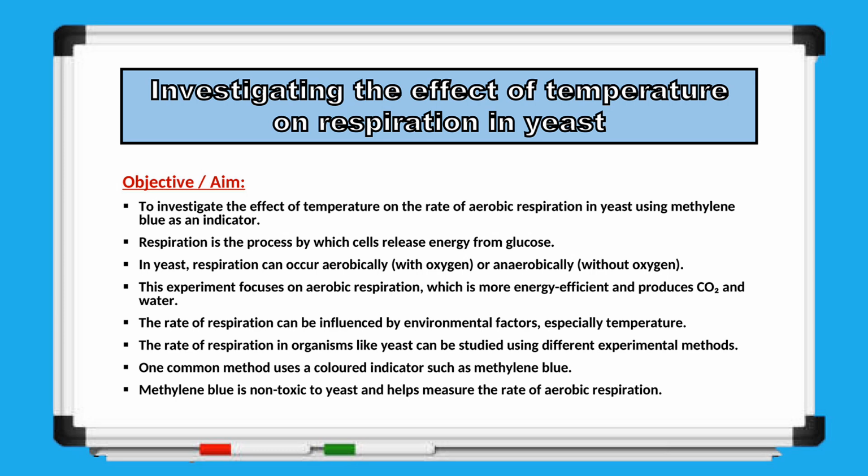To study this, we can use various experimental methods. One common and effective approach is to use a colored indicator like methylene blue, which is non-toxic to yeast and allows us to observe and measure the rate of aerobic respiration.